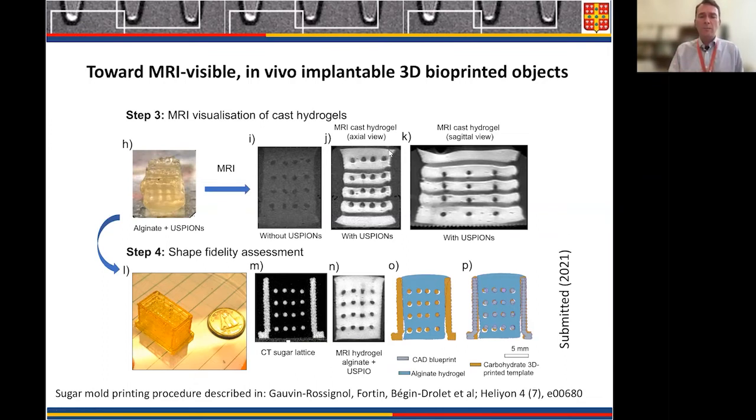Basically, we orient this type of technology to the 3D growth of adipose tissue. Adipose tissue is used for breast cancer surgery or maxillofacial surgery in order to implant lipid tissue. One of the main challenges is to keep a certain oxygen level and a certain level of food to the cells that grow into these hydrogels. And you cannot do that unless you provide a porosity in the hydrogels. So with this casting technique, we can do it.